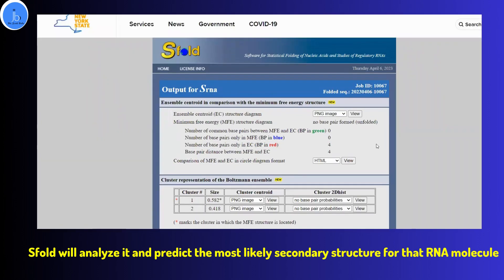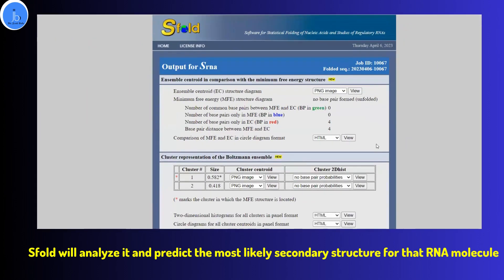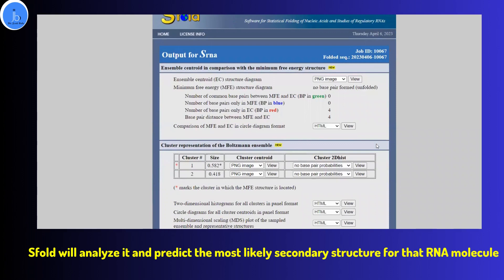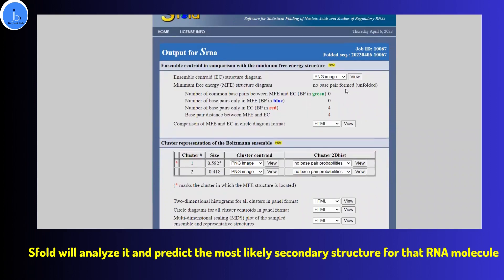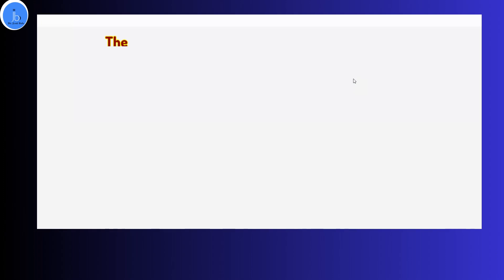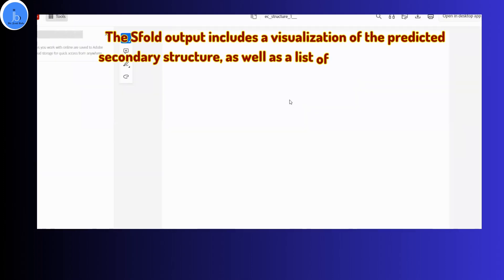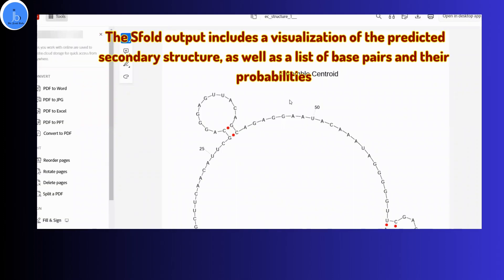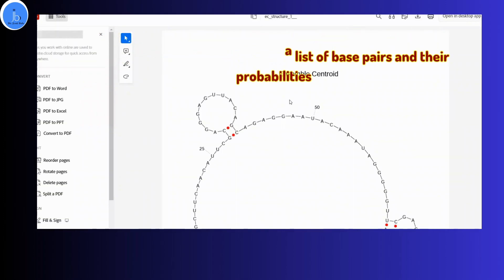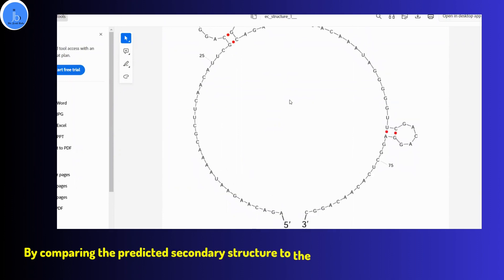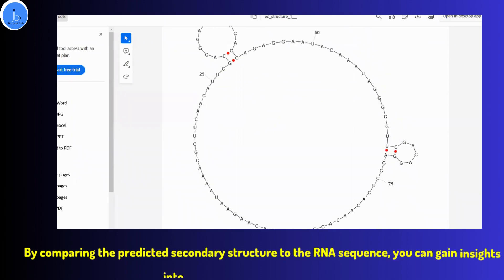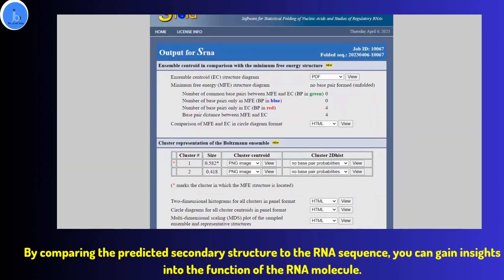The S4 output and results include the visualization of the predicted secondary structure as well as a list of base pairs and their probabilities. By comparing the predicted secondary structure to the RNA sequence, you can gain insight into the functions of the RNA molecule.